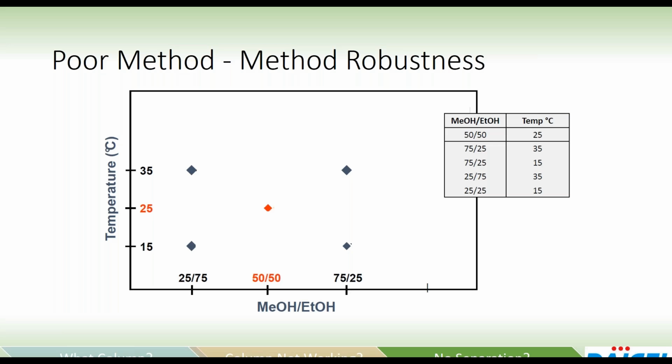We want to have a sense, for instance, of what kind of variability exists within changing temperature, what kind of variability exists within changing the composition of the mobile phase, because it can help us determine whether or not this is a very sensitive chiral separation that we need to be cognizant of when we're taking it forward into our further optimization. So this is what we would call central composite design, where we pick these points that are out on the corners, and we can kind of see the extremes of how the chromatography reacts.